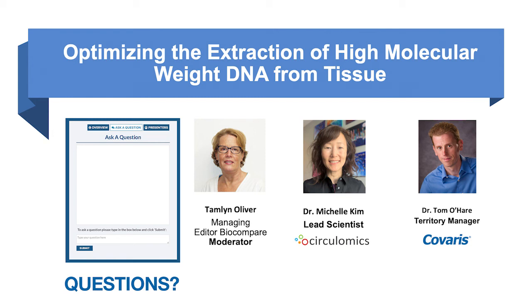And we usually do a couple things. Right after eluting that, I will pipette it with a standard size pipette tip and then let it rest at room temperature overnight. If it's particularly viscous, you could let that rest at room temperature over a weekend, so a few nights. And then before we do QC, I pipette it again. If it's really viscous like that, it's pretty high molecular weight, and you don't have to worry about shearing it with a standard size pipette.